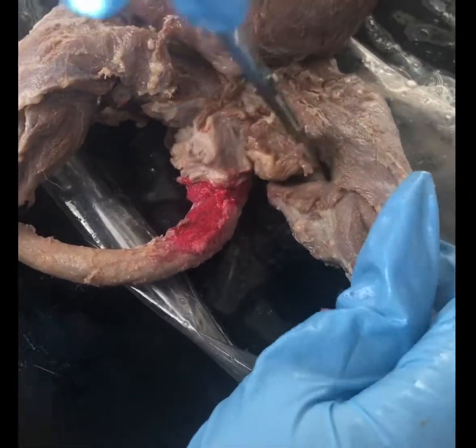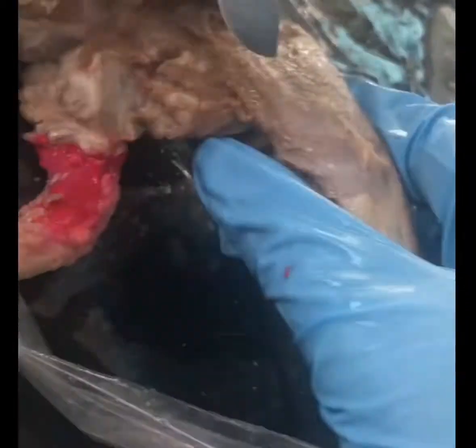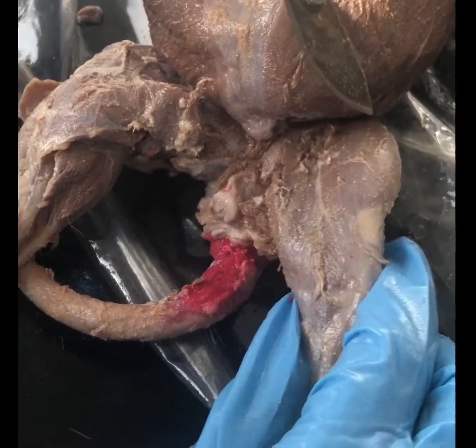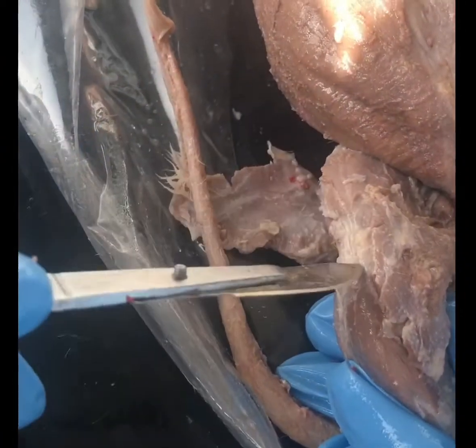So it'd be like in here, like on the inside. And then the biceps femoris extends the thigh and it flexes the leg, so it just runs straight down from here to the knee.